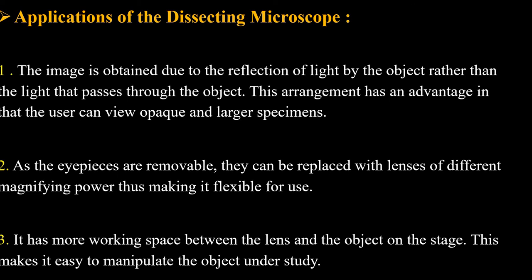Second application: as the eyepieces are removable, they can be replaced with lenses of different magnifying power, thus making it flexible for use according to our requirement. The eyepieces can be changed.